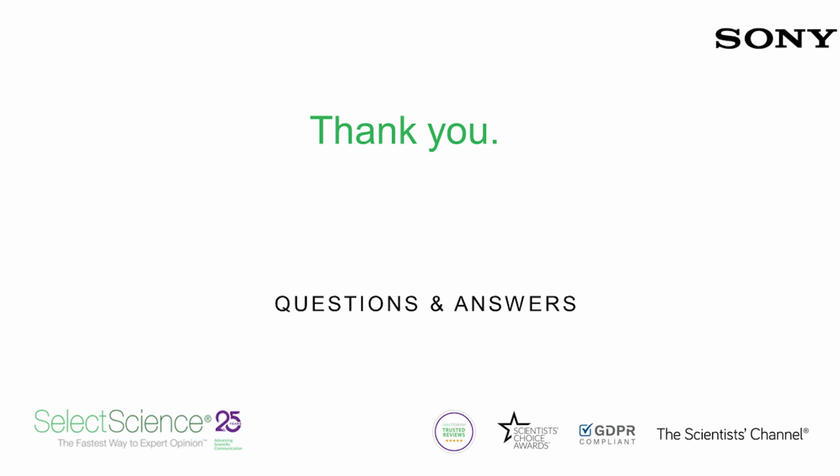So to kick off our Q&A today, my first question for you is, are there advantages in working with single sorted neurons versus nuclei? Are there any neuronal cell types where working with nuclei is preferable?